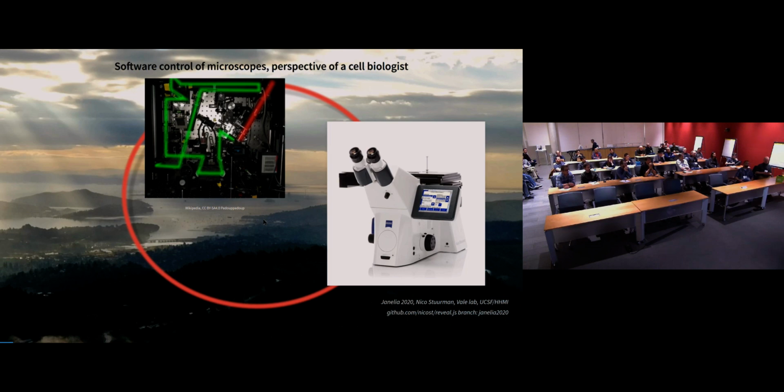So there's a big difference in accessibility, and the normal route this takes is that you sell the concept and ideas of that advanced microscope system to a company, you wait a decade, and then something will appear on the market that is still not as good as that thing there initially. So what all of us would like is we want those systems to be out there and we want them to be used. And one big chunk there is actually having usable, user-friendly software that can run these systems.